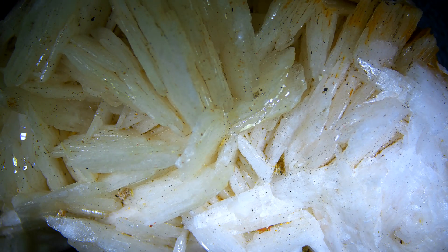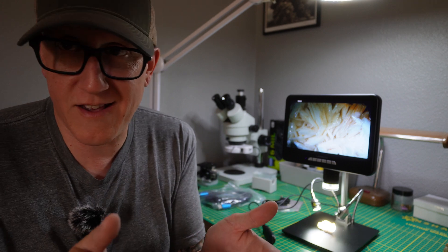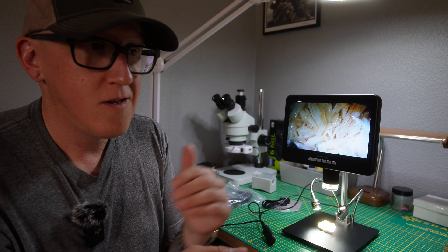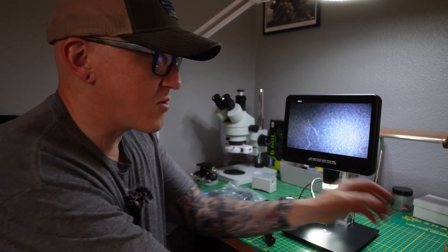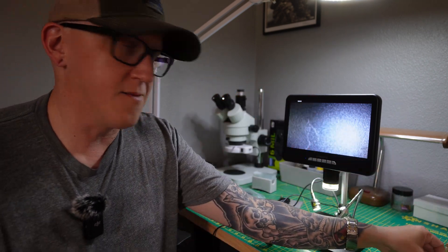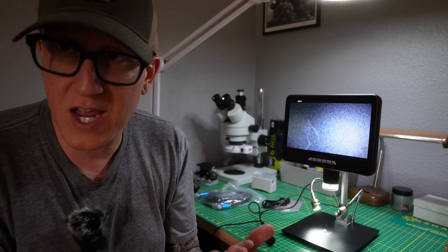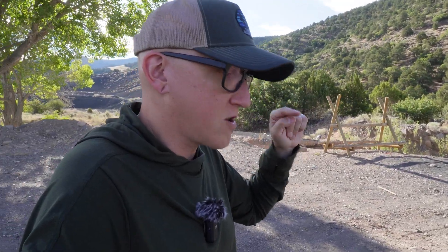We can use this for a lot of different things, and the reason I'm sharing this with you is I want you to get excited about the world of minerals and microminerals, because you can finally do it at an affordable price point. But it's really easy for me to sit here and show you finely prepared specimens, so let's head outside, go out into the field. We're going to do a little bit of collecting and come back and do some identification work using this microscope. If you watched the video out here by Summit, Utah at the Cinder Cone — up this creek and wash area there was a rock with some type of mineral in it. I didn't have a hammer and chisel with me at the time, so I didn't collect any of it. We're going to go collect some of that material.